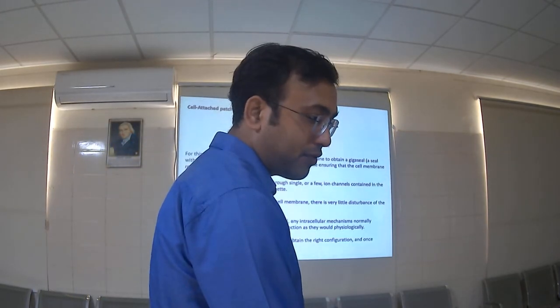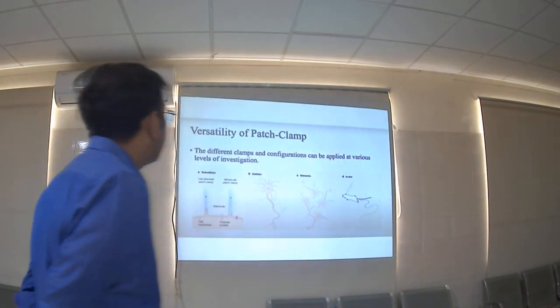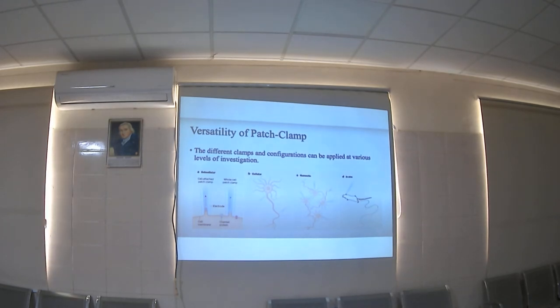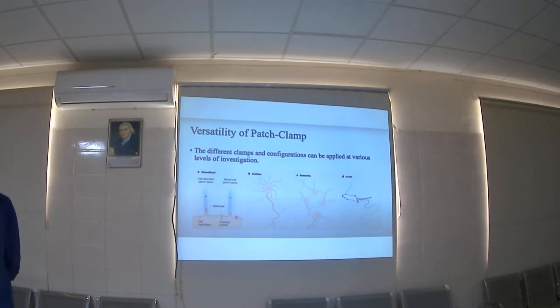So these are the various variations. There is different versatility of patch clamp. The different clamp configurations can be applied to a cell or a network, or even in vivo, even in a live animal. Patch recording can be done, but this is beyond the scope of this lecture.